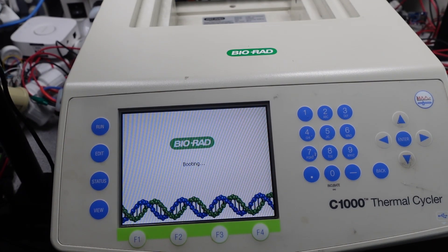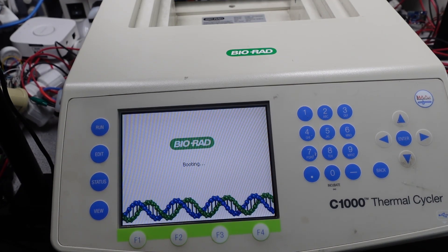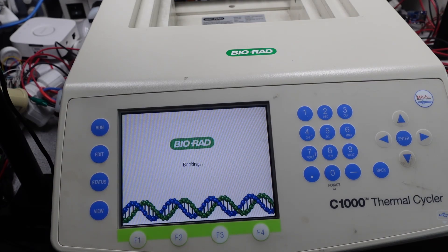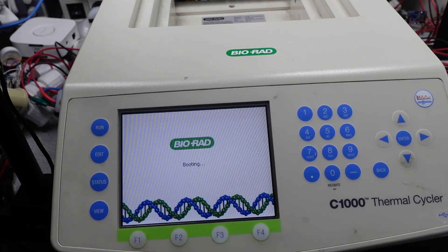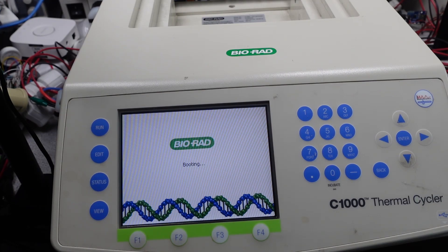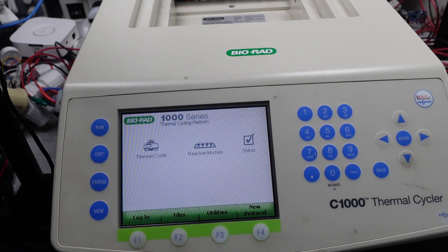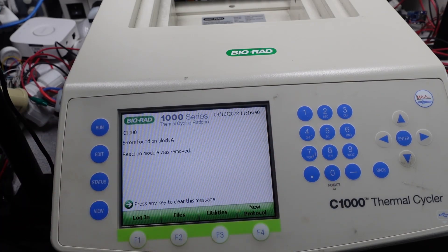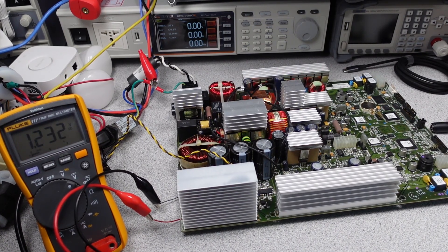The first step in this process is going to be to plug it in. This isn't always the first step, but in this case I want to figure out how it is misbehaving, so plugging it in is the first step. The machine powers up and appears to be okay. The screen comes on and the machine boots the ultra-modern operating system Windows CE. As the machine begins to boot up and an actual cycle is started, the machine starts to make a clicking noise and although it appears to be mostly operating, it will fail and shut off eventually.